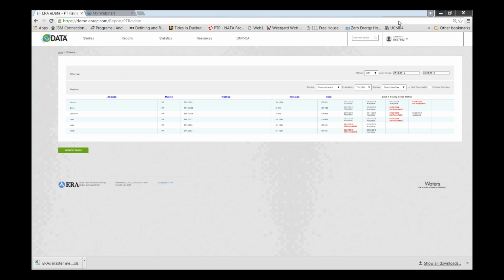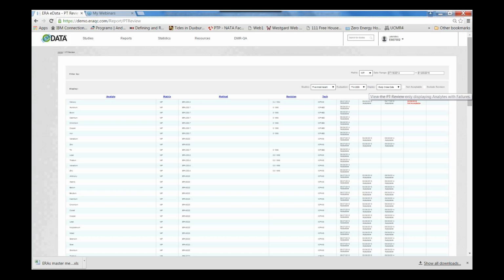So what this is showing you is over your last 5 studies by close date, where you've had unacceptable results. Now, it's set to default to not acceptable, but you can also take a look at all of your results and take a look down through. So these are all WP. We've got our list by analyte. We've listed our methods and revisions, and here are our results. So if I actually review that, it'll tell you the date that it was analyzed, and if you hover over it, it'll also show you what the study was where that failure occurred.